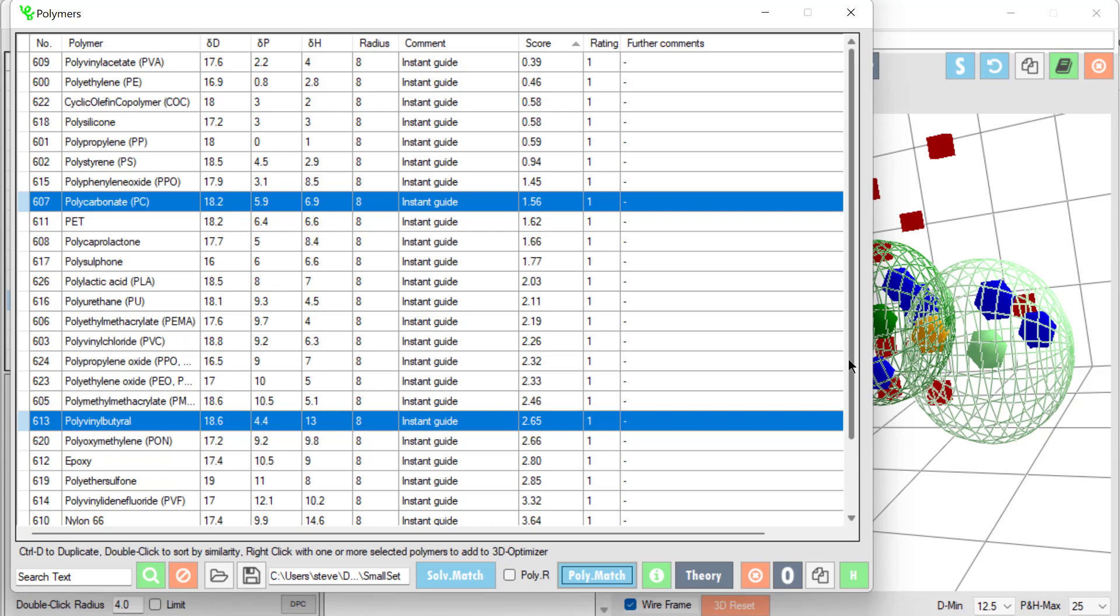And we find that polyvinyl acetate, polyethylene, polysilicone, are good match to xylene.